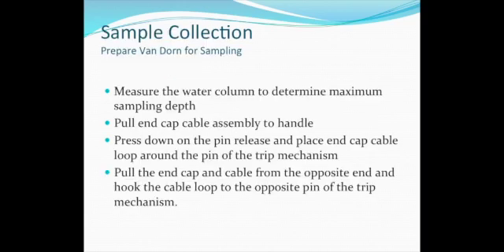Dropping the bottle onto the bottom of the water column would contaminate the sampling area. So remember to measure the water column depth prior to deploying the Van Dorn bottle.